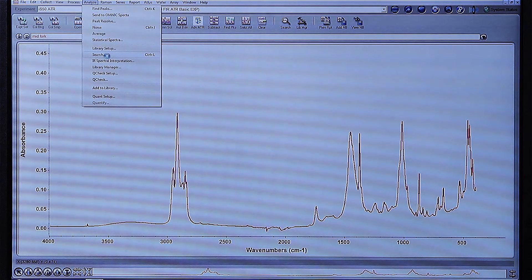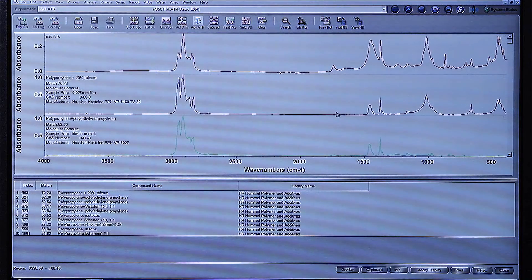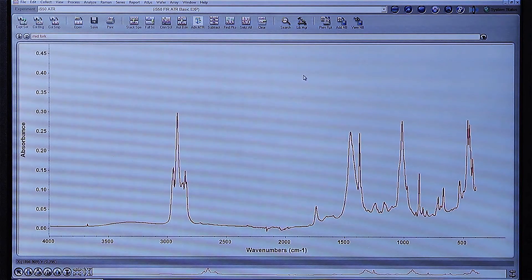I go to Analyze, drop down to the Search button, and immediately the results from our search show up. According to the library, the sample is polypropylene that has 20% talcum. This is something we might expect to see with a biodegradable or compostable fork. And within those few seconds, the instrument is now set up to do far-infrared analysis.